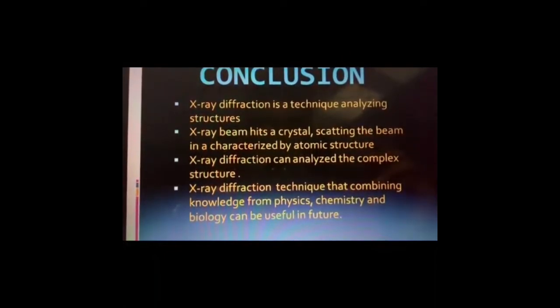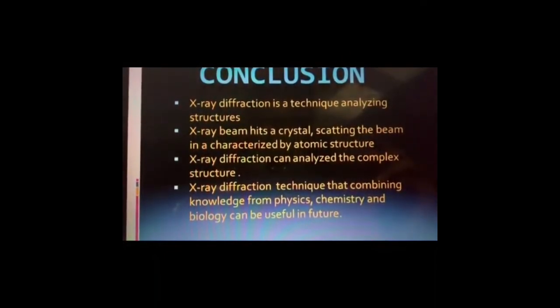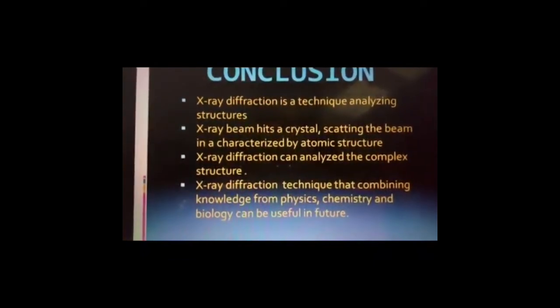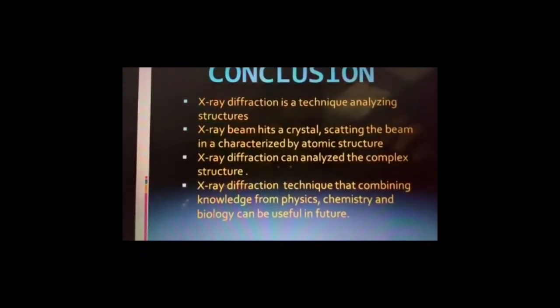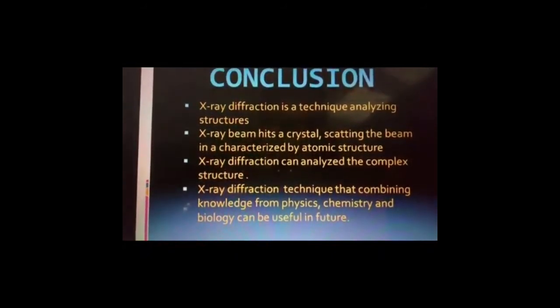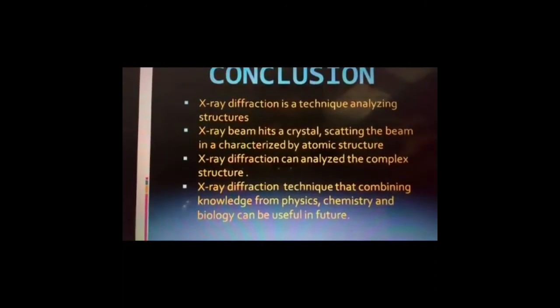X-rays also are not absorbed very much by air, so the sample does not need to be in an evacuated chamber. However, the disadvantage of X-rays is that they do not interact strongly with lighter elements.